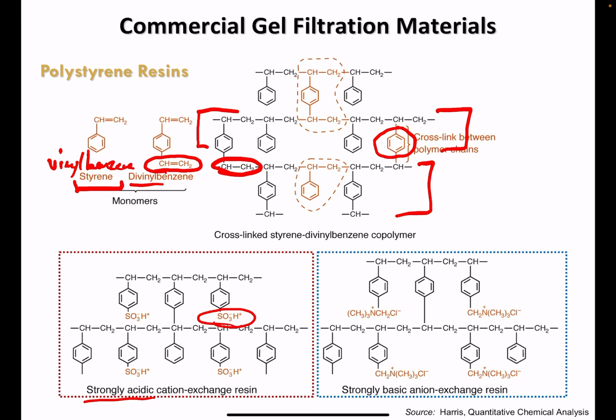And the opposite application, a base anion exchange resin, can be programmed by putting ammonium groups with a fourth-fold substituted nitrogen in place to allow for that positive charge to be applied to the polymer, charge balanced by chloride in this case, whereas the former was charge balanced by that proton that's acidic.